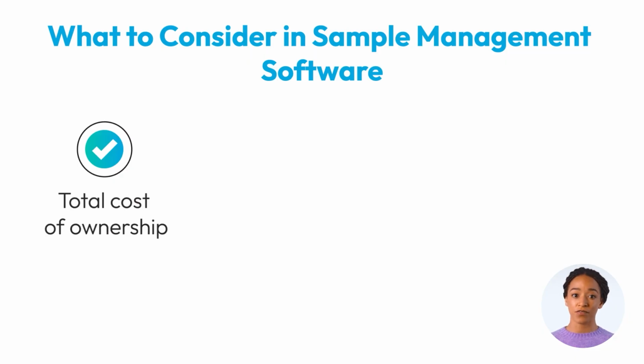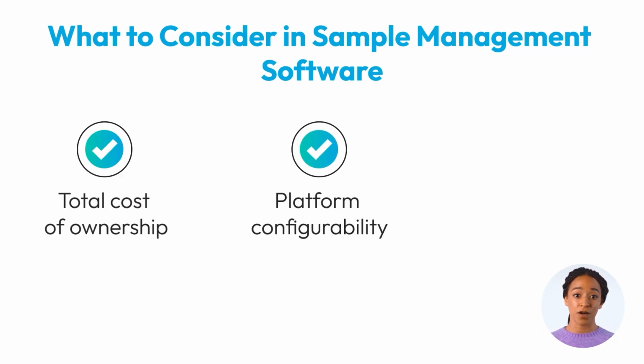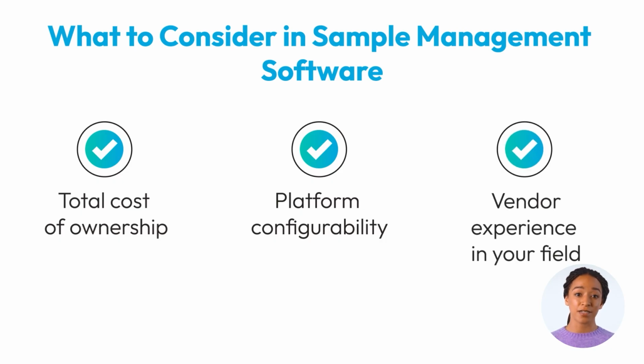What is the total cost of ownership over 5 years? How configurable is the platform for future workflows? Does the vendor have experience in your field, whether that's clinical diagnostics, translational research, or regulated bioanalysis, and understand the specific compliance requirements and data security needs of sample management software for regulated labs?